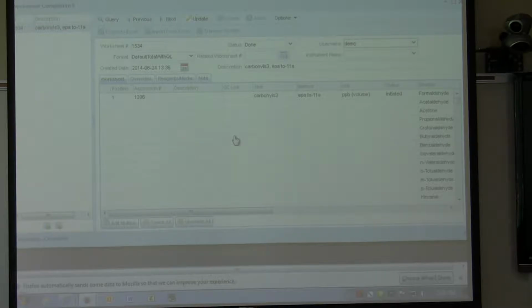I think in the current version, when you're doing the import from Excel, it forces you to be in update mode to do that. You don't have to go into update mode to import from Excel. So if I switch it back to working, these are all active, so you don't have to go into update mode to import from Excel. It'll do its own update mode, importing from Excel. It'll just import, it'll just go.